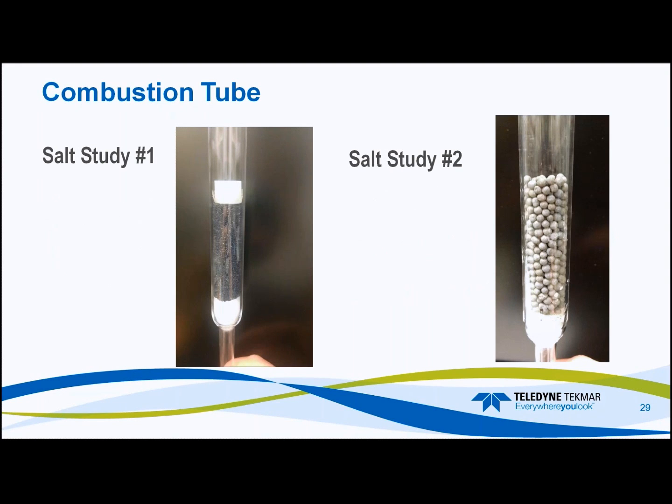So this is what the combustion tube looks like. Over here was the quartz wool, small catalyst, the retainer ring and platinum screen, and over here, all we have in this tube is 1/4 gram of quartz wool and 10 grams of a larger sphere catalyst.